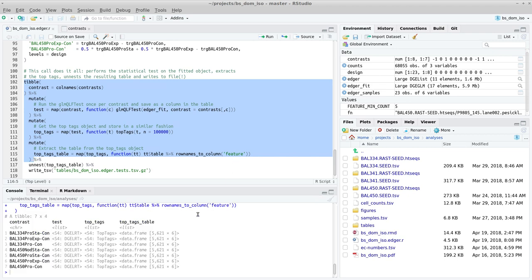We run that. Now, what we get in our result is actually a new column containing a data frame. So this is a table that by itself contains data frames. Tables can also contain tables, of course, but this is a nested table, because it's a sort of data frame that contains data frames.